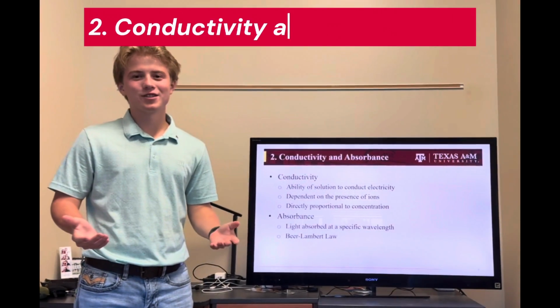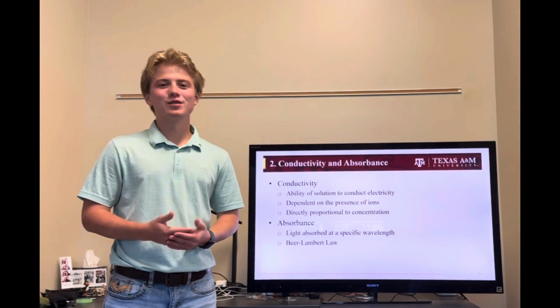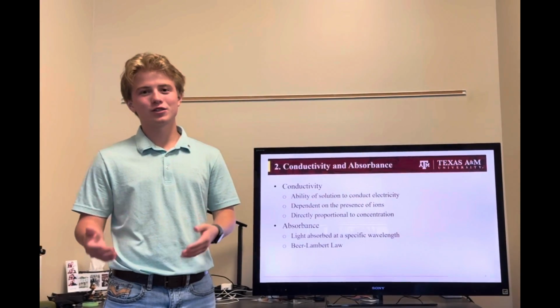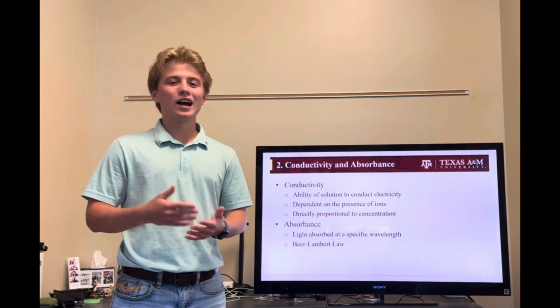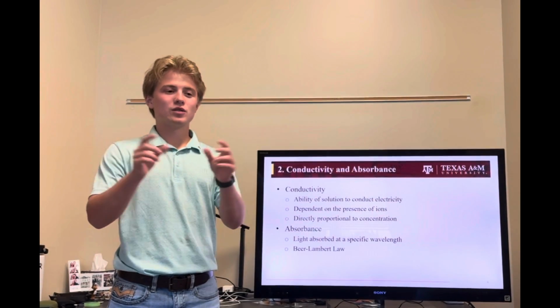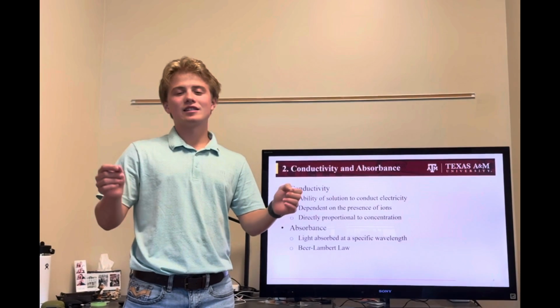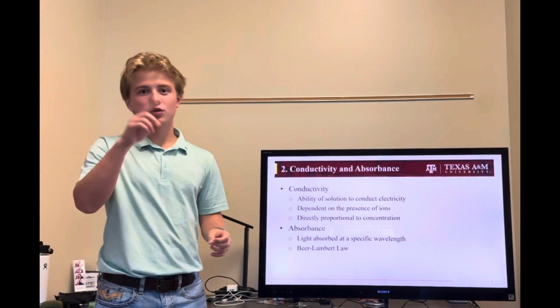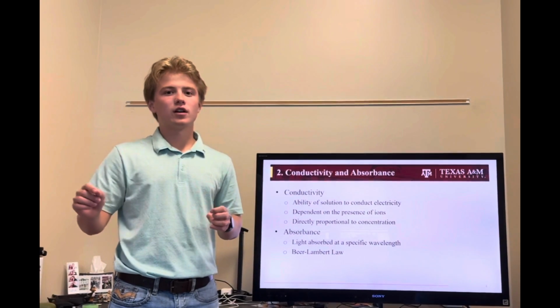So you might be asking yourself, what is conductivity and absorbance? Conductivity is the ability of a solution to conduct electricity, and this is very dependent on ions. An ion is when a chemical breaks down into its two ions, a positive cation and a negative anion. It has the ability to conduct electricity through a solution as electrons transfer.